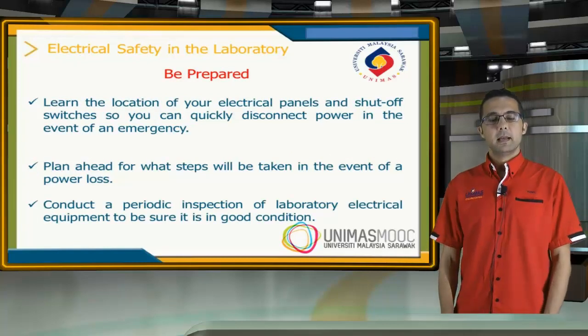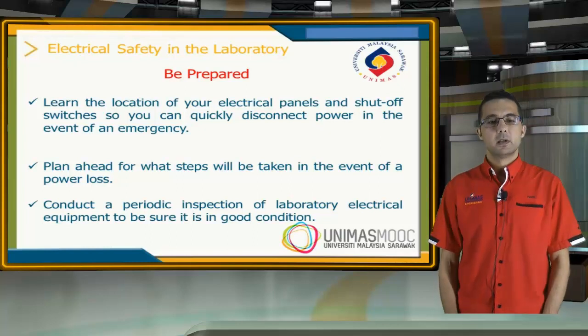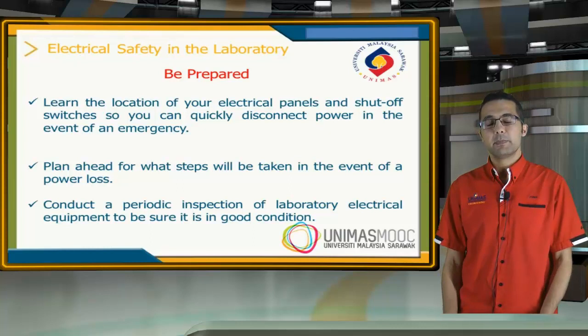Be prepared. Learn the location of your electrical panels and switch-off switches, so you can quickly disconnect the power in the case of an emergency. Also, plan ahead for what steps should be taken in the case of danger.